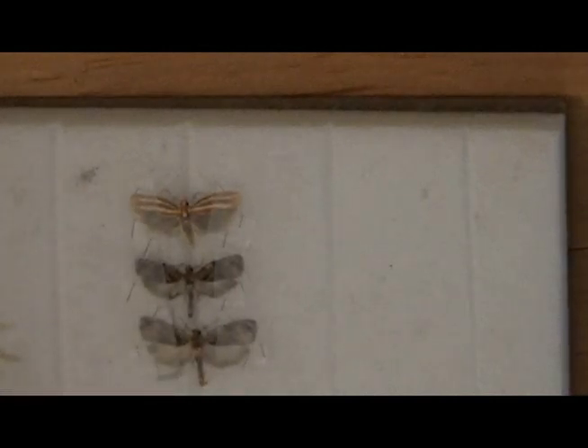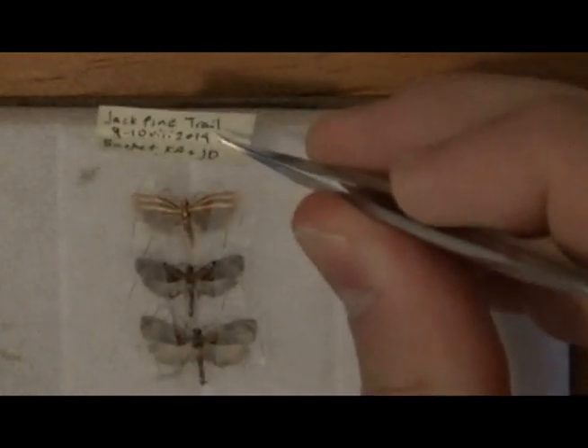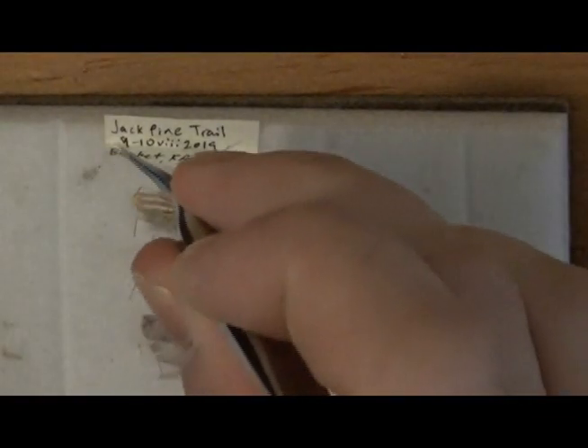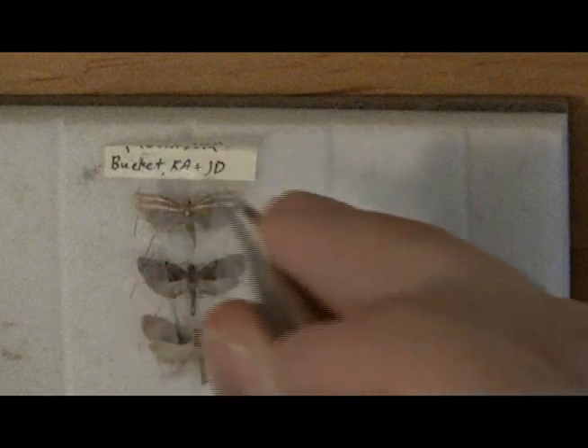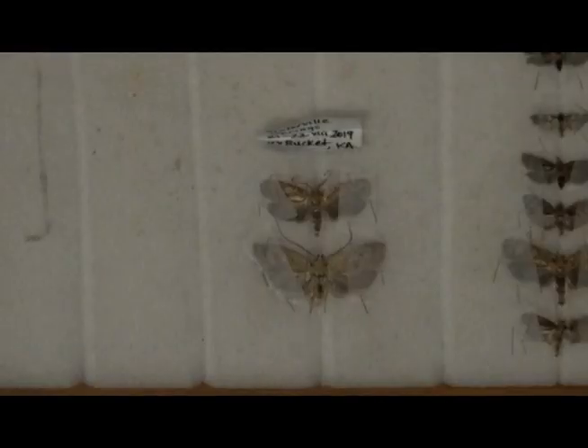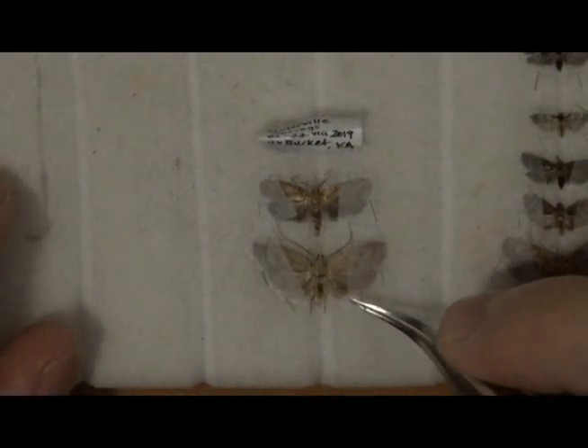Once I'm done, I'll make sure to label all the moths so I know when and where they were collected. Depending on temperature, humidity, and size of the moths, it can take a few weeks for them to dry. I like to leave them on the foam for at least two weeks. Store them in a dry, airtight environment to prevent pests from destroying them. After two weeks, I'll use fine forceps to remove the squares and any minutens I used to hold the antennae in place.